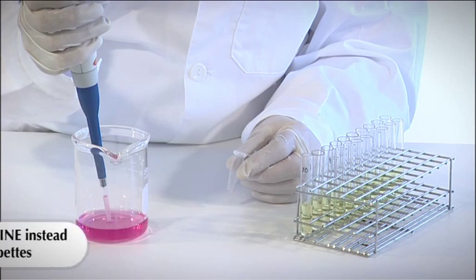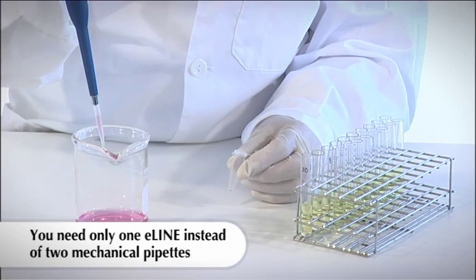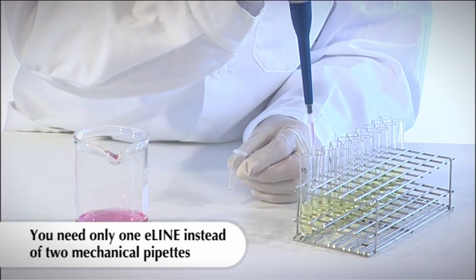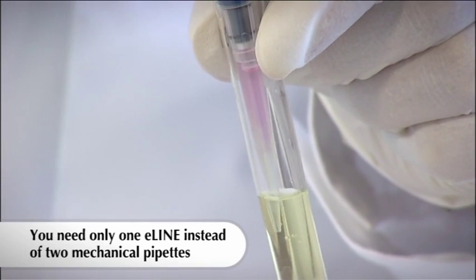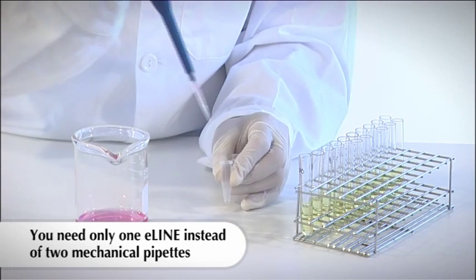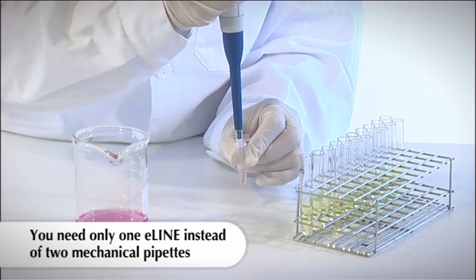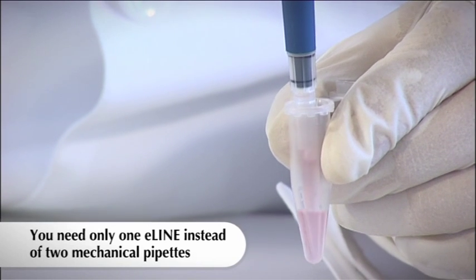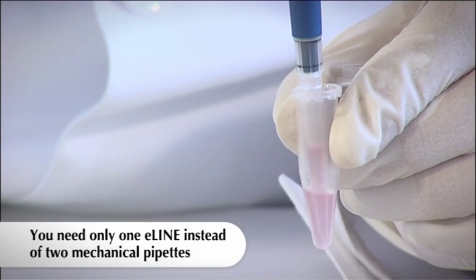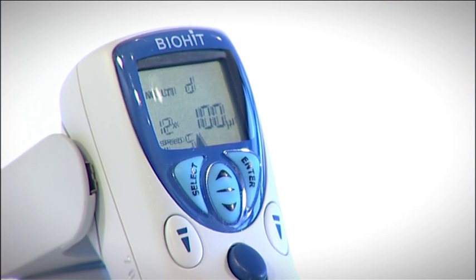A general misconception related to electronic pipettes is that they are believed to be much more expensive than mechanical pipettes. This is partly true. However, it's good to bear in mind that one E-Line covers the volume range of two or even more mechanical pipettes. The extra-wide volume range enables you to do several pipetting tasks, such as diluting with a single unit. In other words, instead of working with two mechanical pipettes, you need only one E-Line.